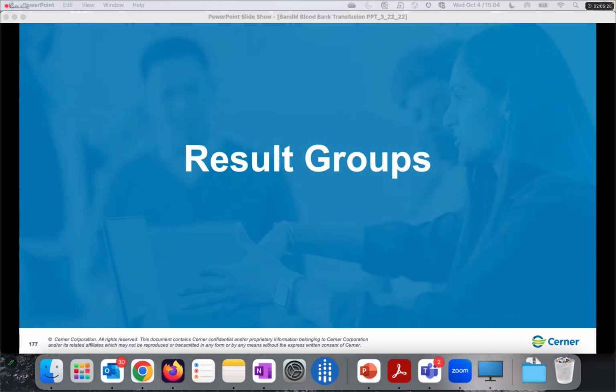So result groups are an optional functionality that are pretty darned helpful, but not technically something that we need to build out. You probably will have at least a couple of them, but maybe not necessarily something that we have to build quite a lot.